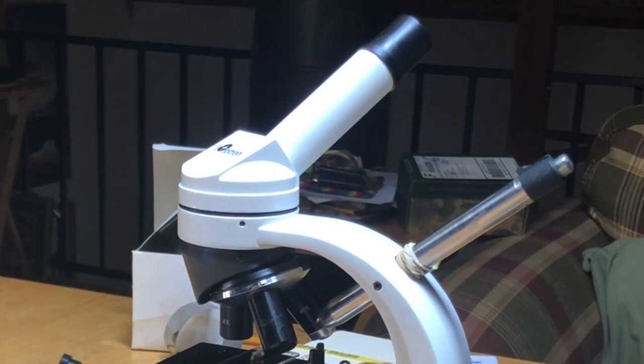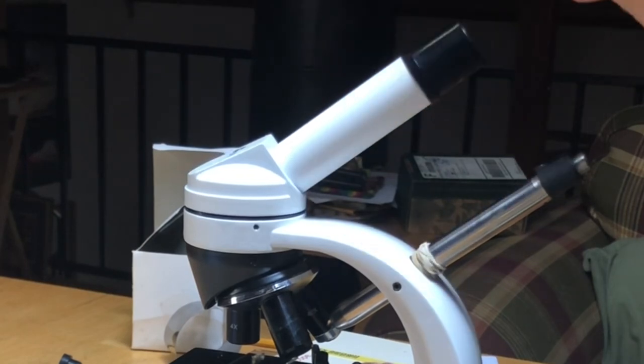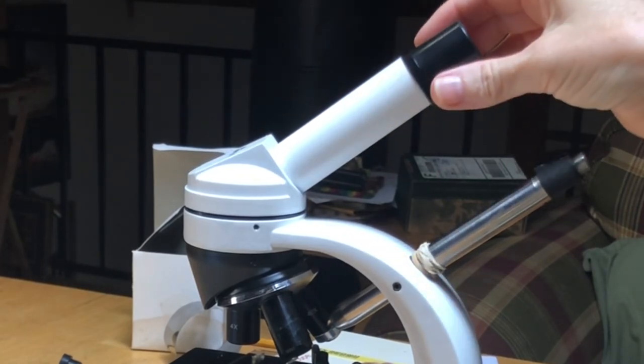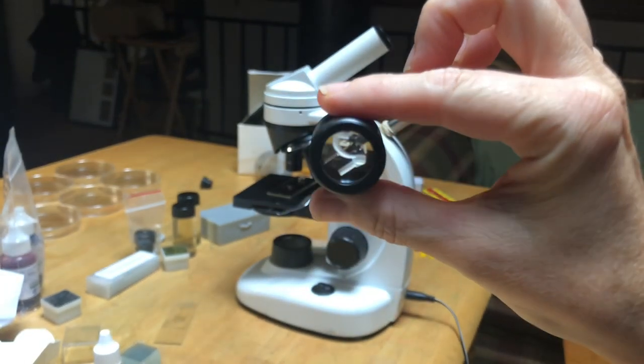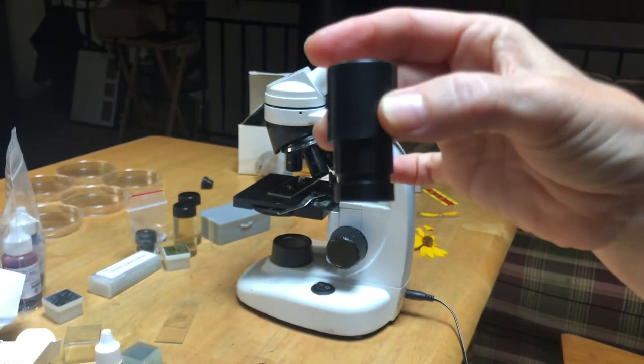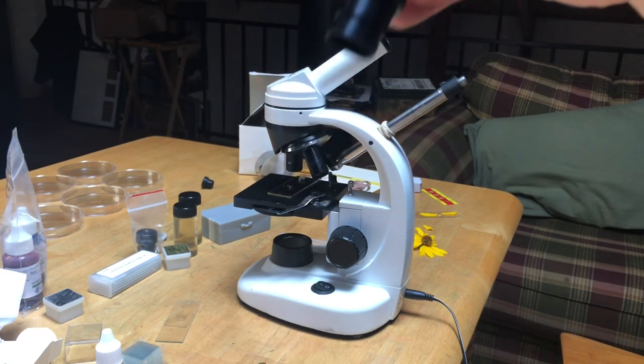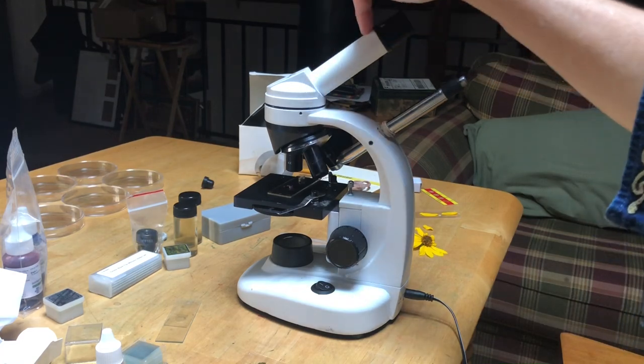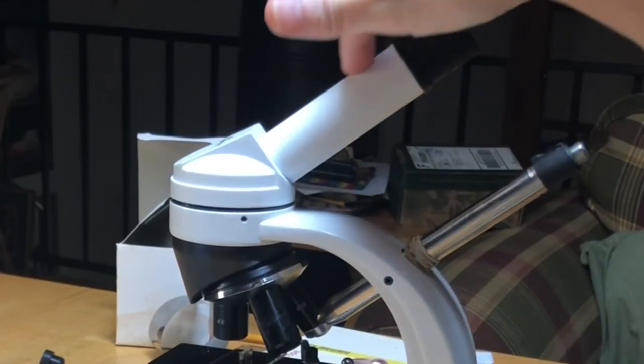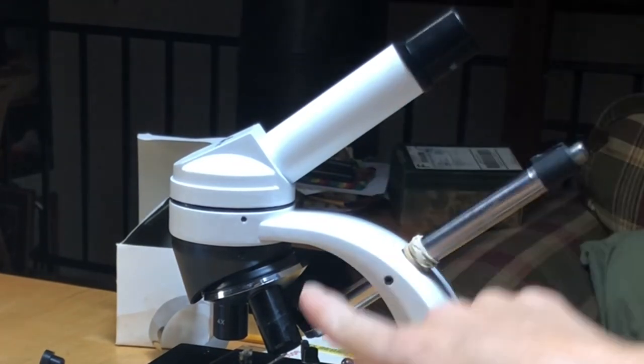Mine comes out, I'll show it to you. I have two in mine, one is 10 and the other is 16. And I can't remember the name of this, it might be eye tube or barrel, I can't remember. But this is the eyepiece.